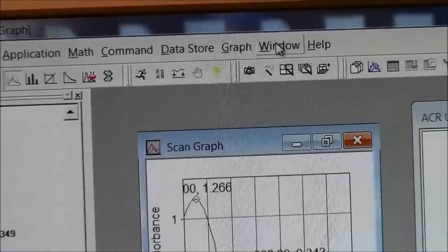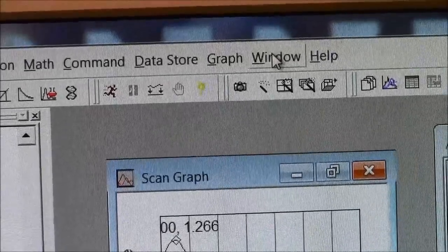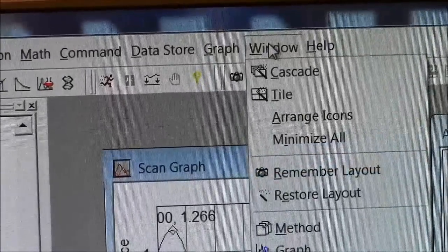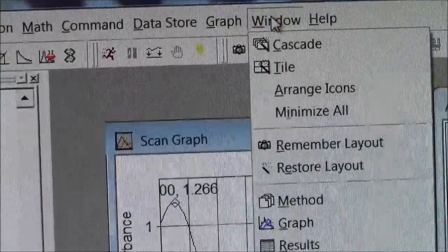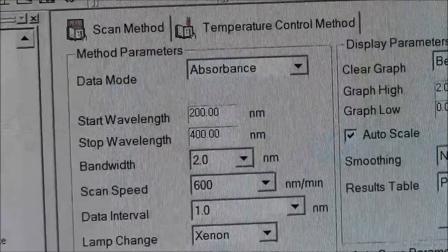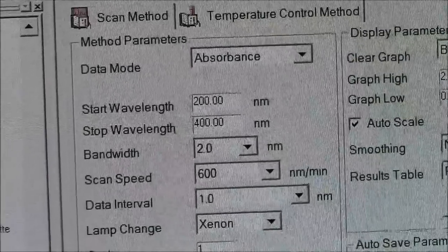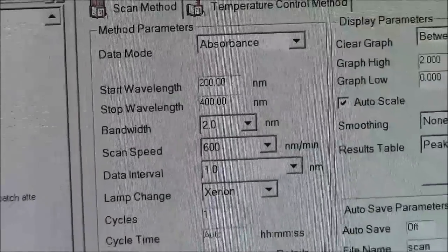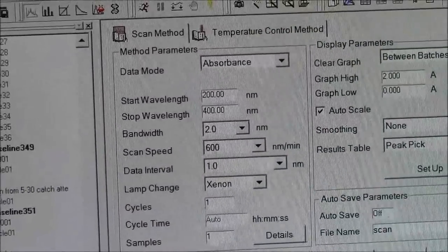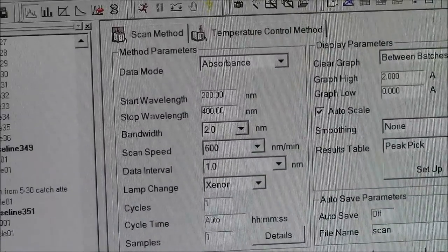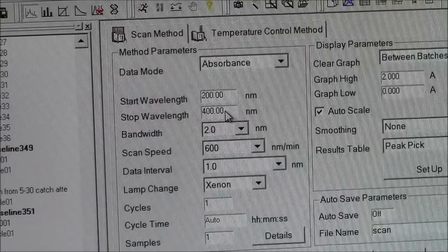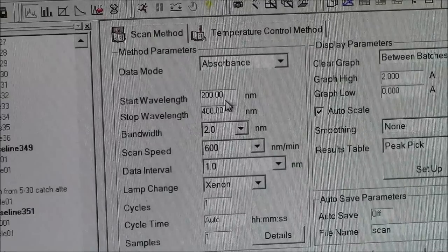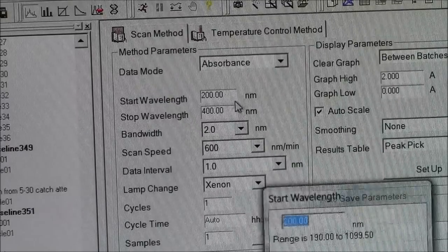So up here at the top of the screen, it says window. And you want to choose method. This brings up a number of choices. The standard is 200 to 400 nanometers. And maybe that's fine for what you're doing, but this is where you would adjust it.